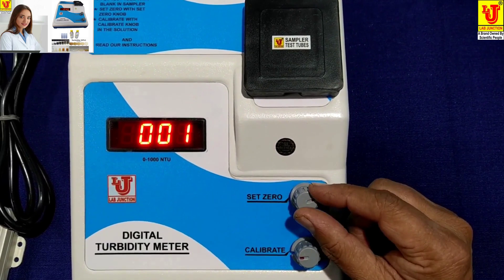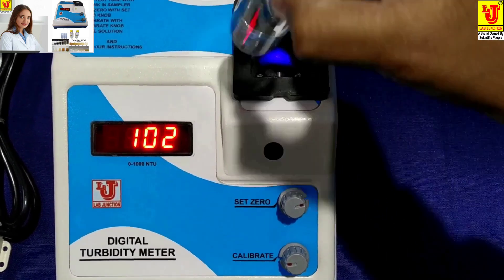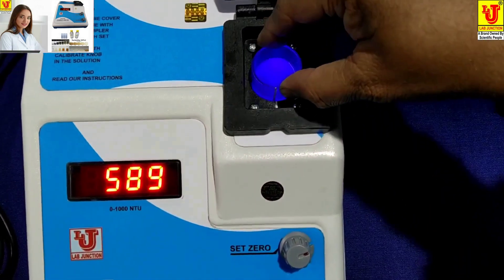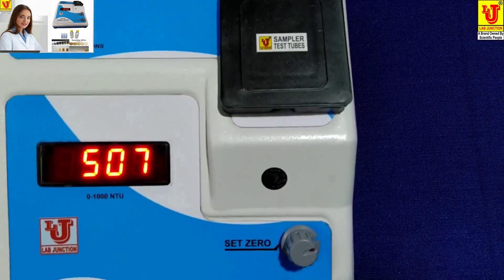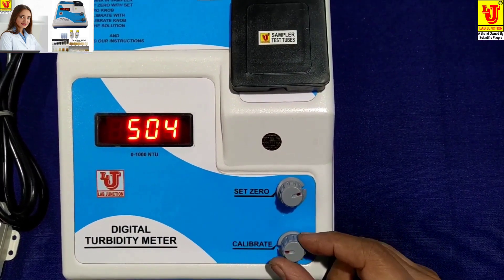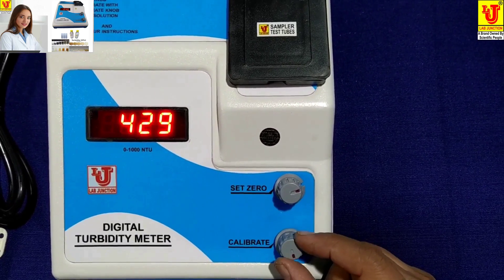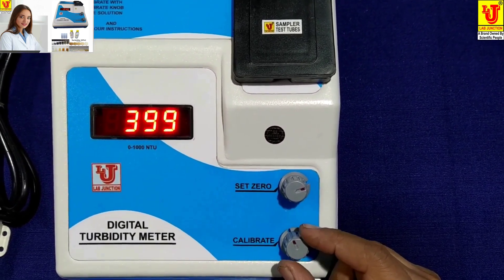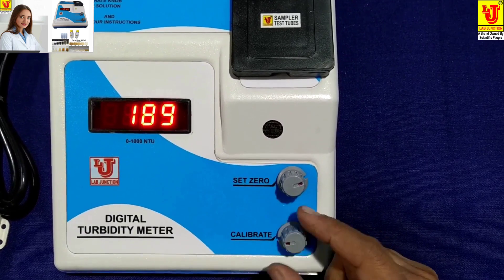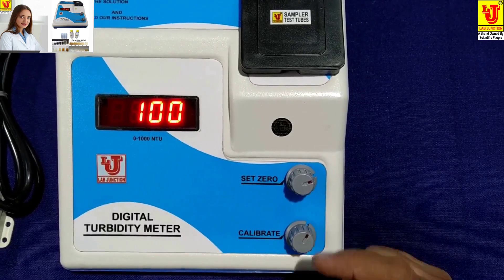I am again setting that. Now insert your standard solution — 100 NTU per JTU — like this. Now you have to set your standard value from the calibrate control. My standard value is 100 NTU per JTU.